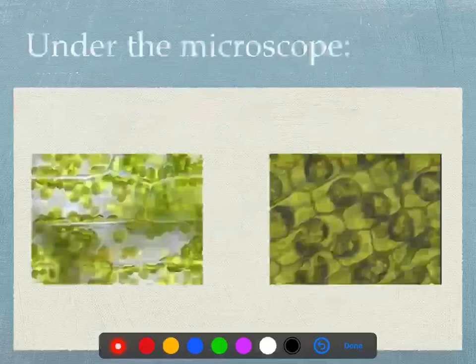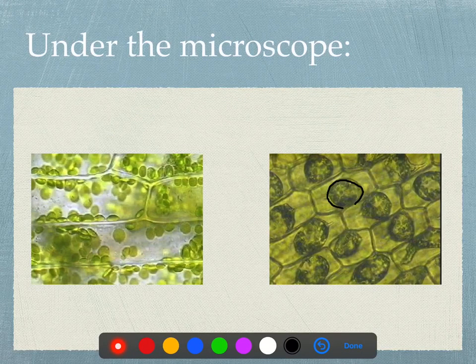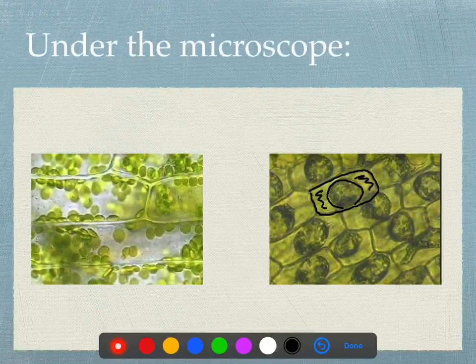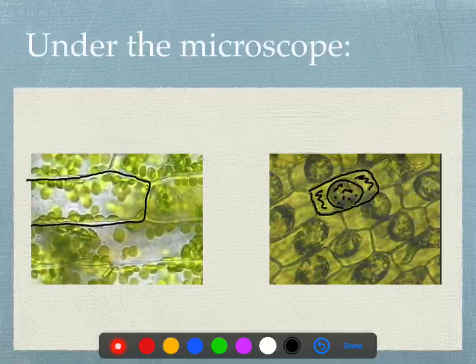All right, so let's look at some images of what this would have looked like under the microscope. Look at that. Here's the cell membrane completely peeled away from the cell wall of the plant cell. And look at all this airspace, right? And all the chloroplasts are somewhere in here now, dragged to the center.